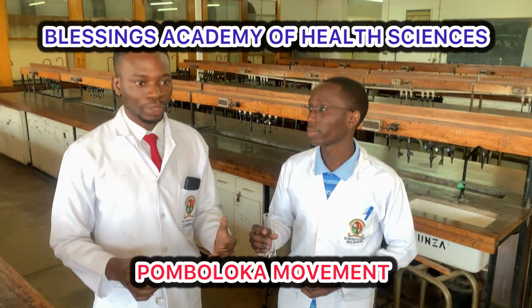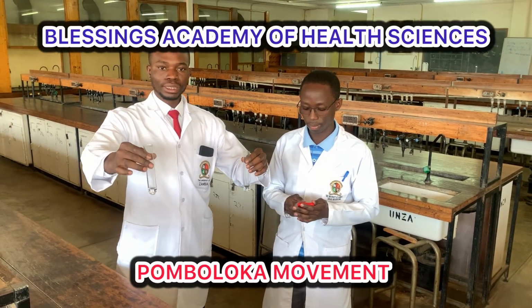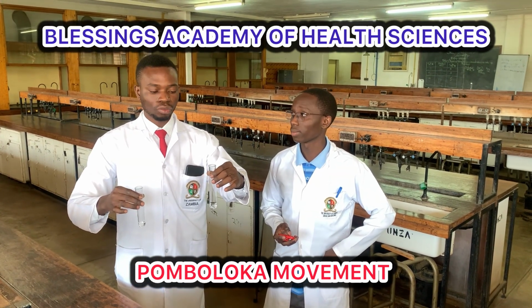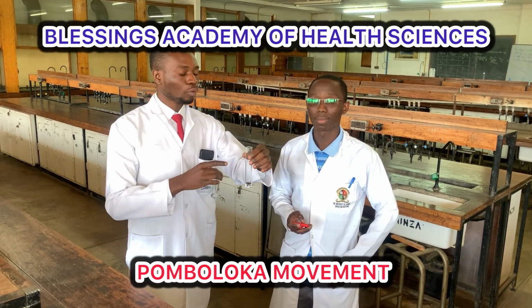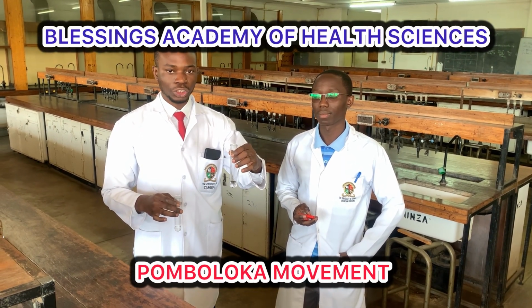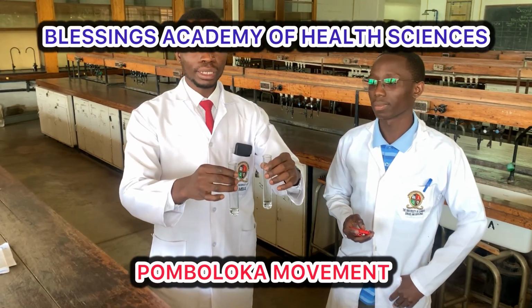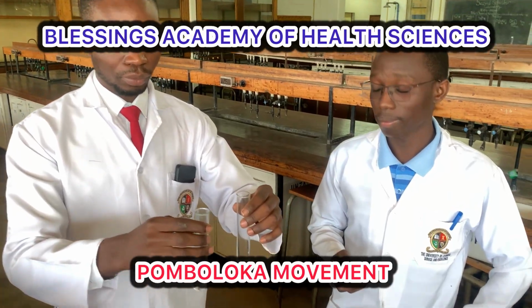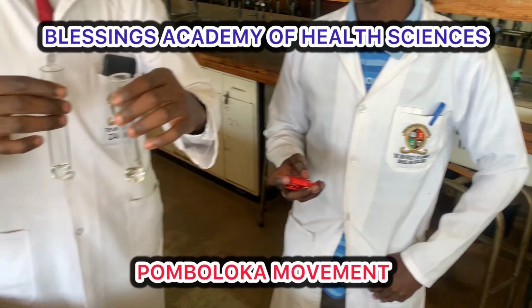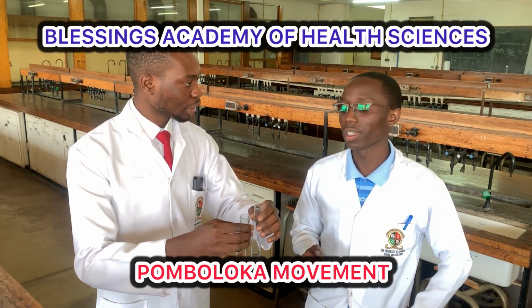Yes. So he has the timer here. Mr. Shola has a timer. And what we have here is sample B. And what we have here is the diluted sample of A. Remember, he added 4.5 mils of A, plus 0.5 mils of distilled water. And what we're simply going to do here is mix them. Once I mix them, it's going to start the timer. Once the solution of A touches the solution of B, it's going to start the time. And once it sees any color change, it's going to stop it. Isn't it, Mr. Chor? Exactly.